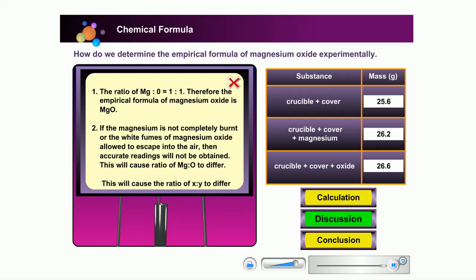If the magnesium is not completely burnt or the white fumes of magnesium oxide are allowed to escape into the air, then accurate readings will not be obtained. This will cause the ratio of magnesium to oxygen to differ.